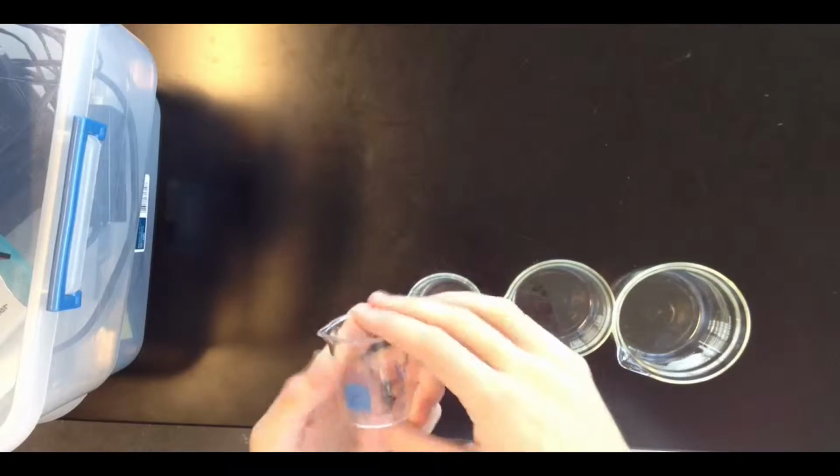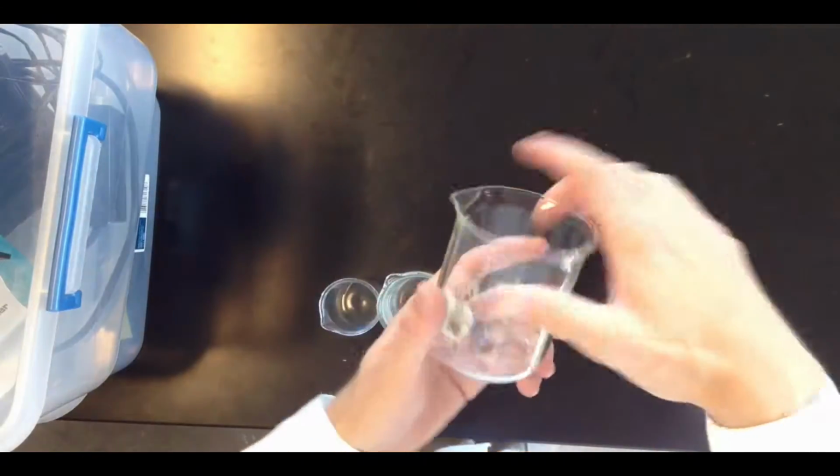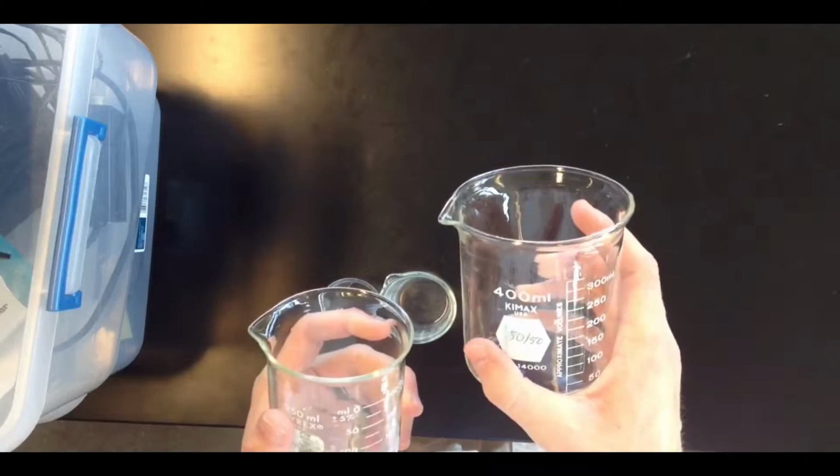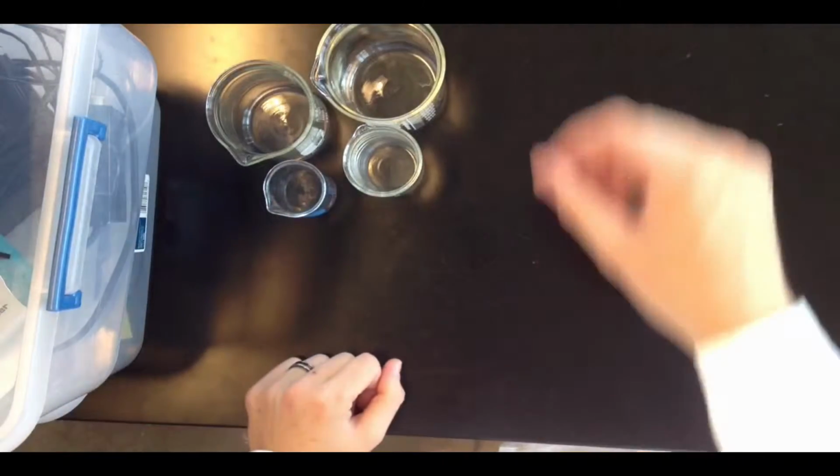And they come in different sizes. Here we have a 50 milliliter, a 100 milliliter, a 250 milliliter, and a 400 milliliter beaker. And these are really important, and we'll use them almost every day in the laboratory.